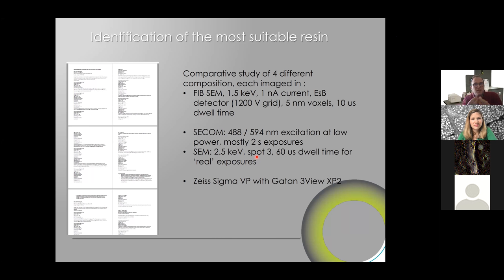They did some quantification. They were imaging in a very strict way, but then they just gave me their feedback, like, well, this one is nice to do, this one sections well, this one sections not so well, the contrast is good, we have a hard time to find the focus, we have a hard time to set the astigmatism. So a very intuitive way of working. It was definitely not something I would say mathematics driven or physics driven. It was a feeling from a biologist doing some work.